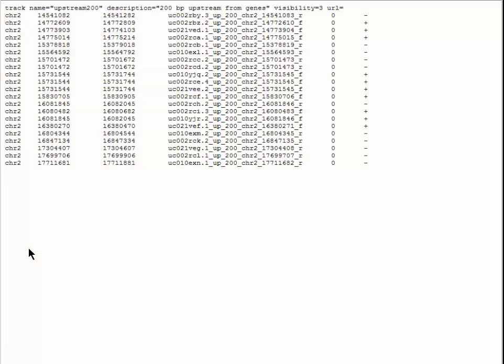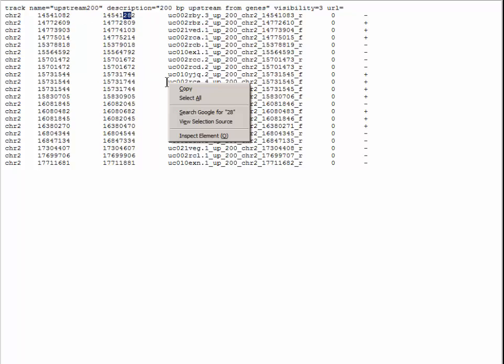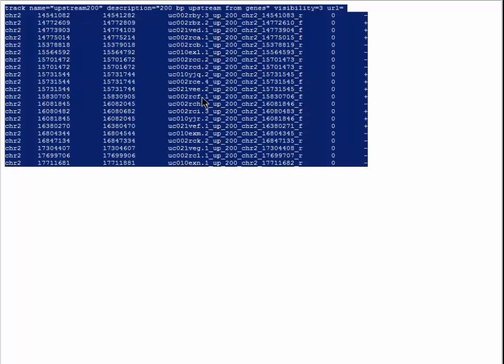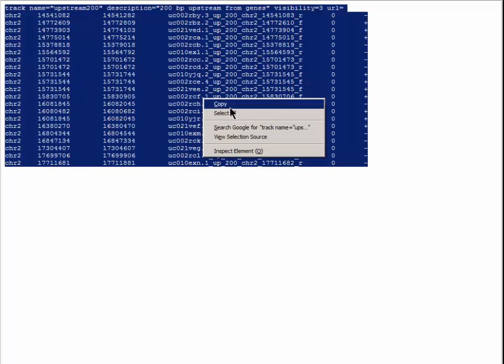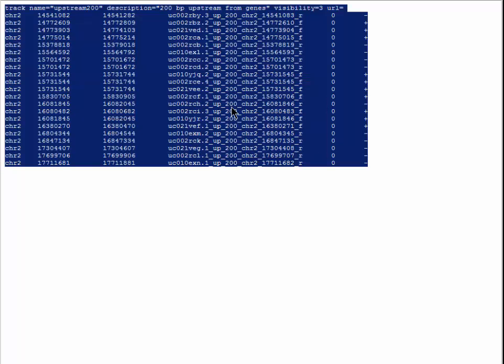Each one of the transcripts has an individual item that's 200 bases in extent on this page. So we will select all on this page and then copy all of this back into the genome browser.